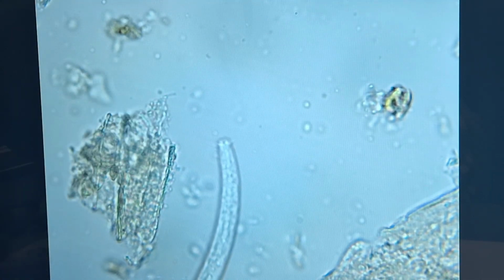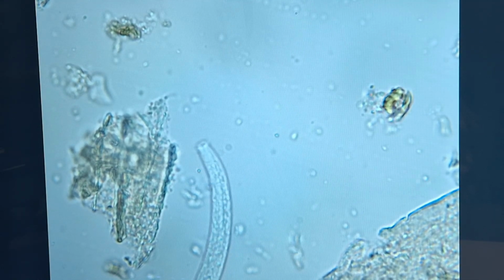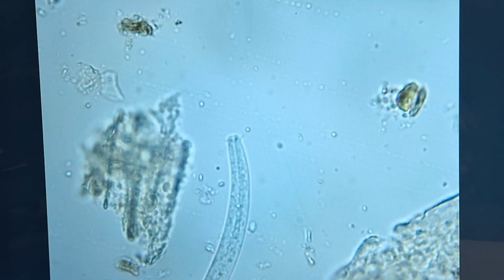You can tell by the mouth parts. There's bacterial feeding, fungal feeding, opportunistic omnivore. There's even predatory that hunt other nematodes. So I believe there's 5 different types.